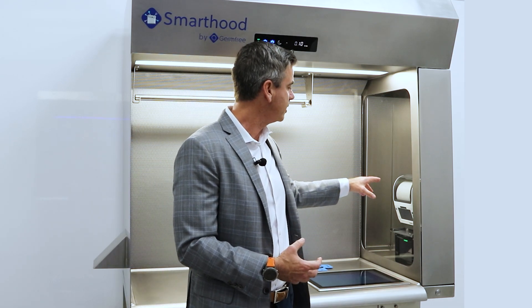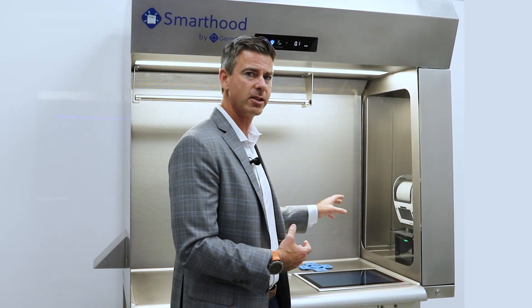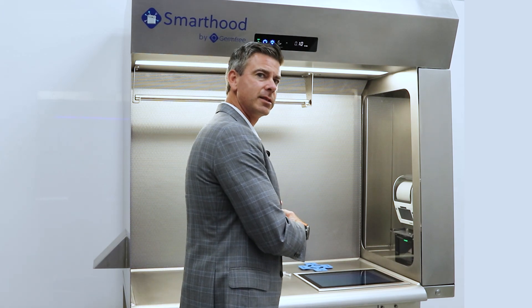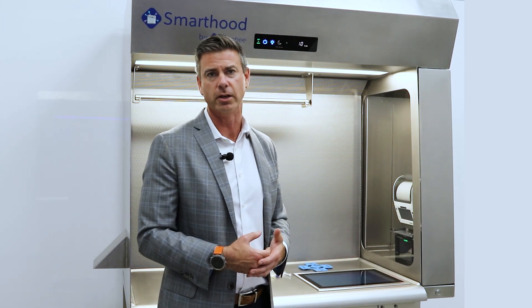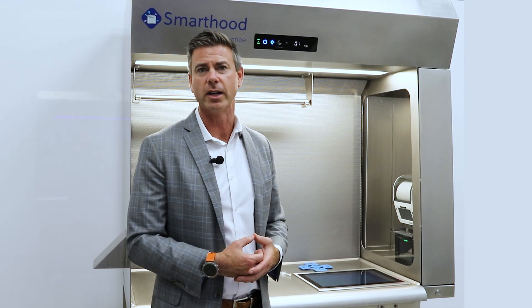Last, we have a Zebra printer and scanner. These are going to allow you to scan in your components and print labels into the sterile field. So all of this integrated seamlessly into the primary engineering controls is really a first of its kind, and we're excited to let you guys take a look at it.